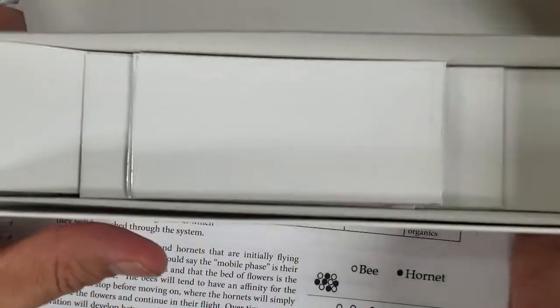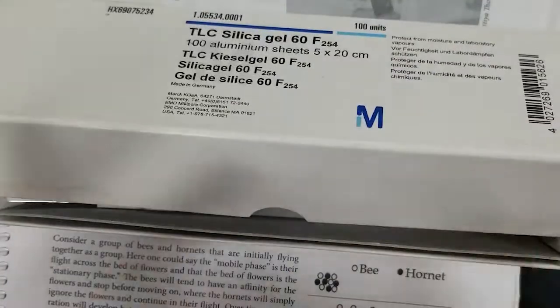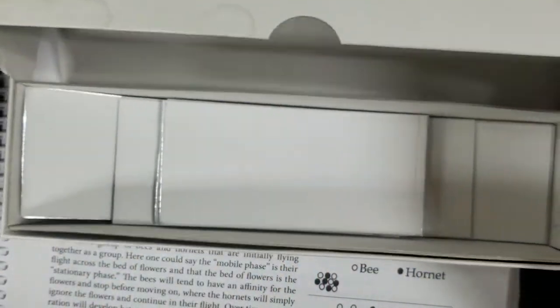I'm going to be careful now not to touch this with my bare hands because you don't want bare hands to touch TLC plates because the oil in your skin will show up on the plate. So please be aware of that. Wear the gloves, and it's not for necessarily safety. It's meant to not mess up your data. Okay, so before we get started on the actual experiment, I did want to show you a little demonstration that give you more of a visual representation of what chromatography is, the separations of colors.